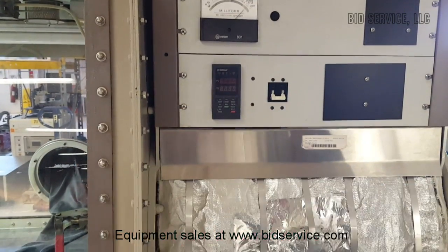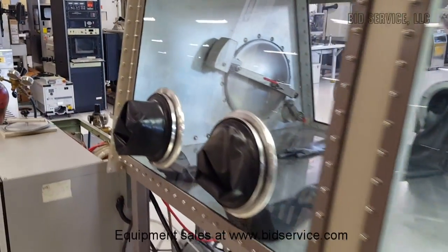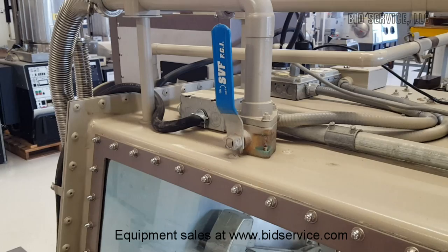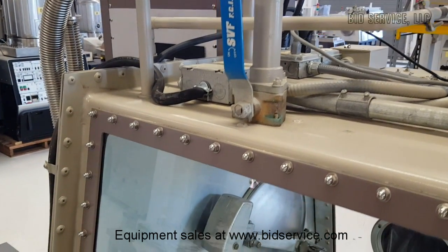On the other side we have the same setup — a five-wire 208 three-phase with a neutral and ground coming in over here, supplying power to the left side of the system. Both sides are on 30-amp breakers.